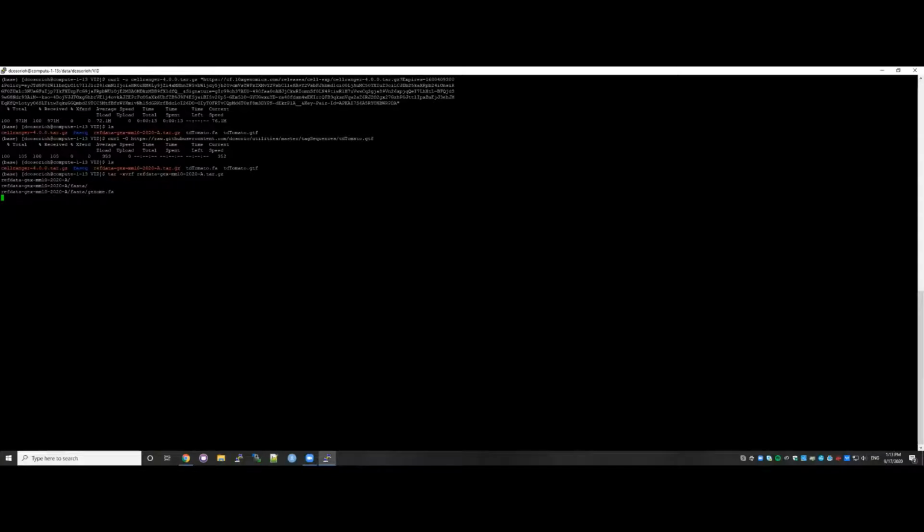So you can use it if you don't have a transgene in your sample, but in this case, the professor wants to quantify also the tdTomato. Usually when I want to add something to the reference, I will do that before indexing, before build, like STAR genomeGenerate, before this step. Let me show you how I do that.